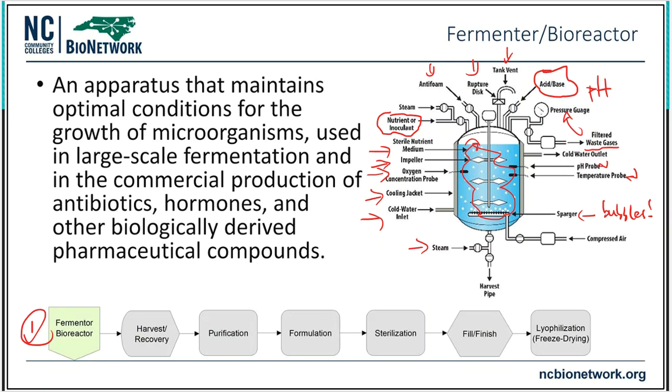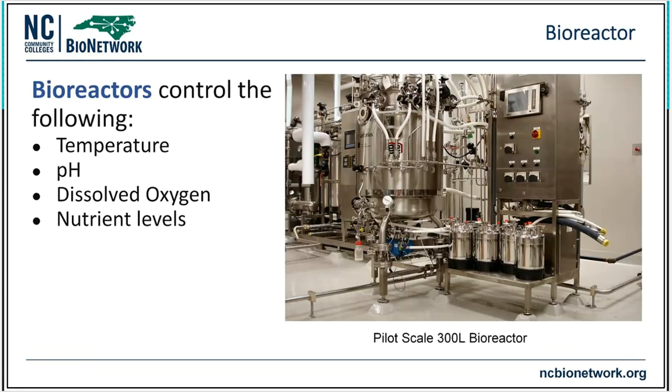All right, so with that said, there's a little schematic. What's a schematic? All right, well, give me a real picture, Tracy. I'll show you a real picture. Here is a bioreactor, and this says pilot scale. All right, so what these things are, they can be very tabletop friendly. So bioreactors and fermenters can go onto a tabletop, and those tabletop can be like testing grounds. Let's see if we can do what we need to do with it.